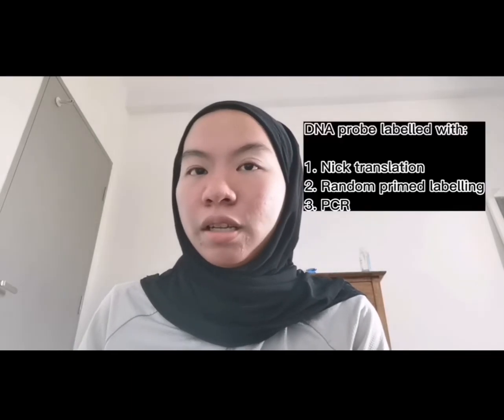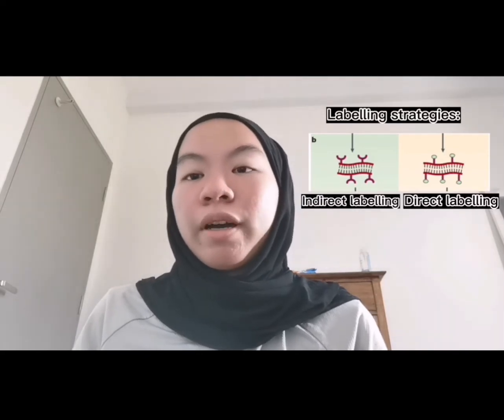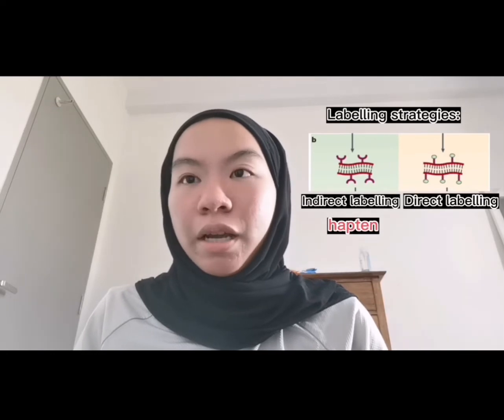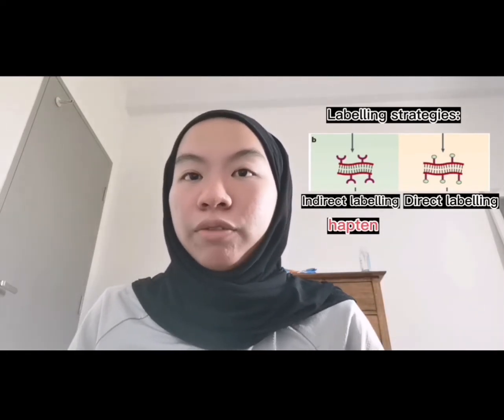The basic elements of FISH are a DNA probe and a target sequence. Before hybridization, the DNA probe will be labeled by various means such as nick translation, random prime labeling, and also PCR. Two labeling strategies are commonly used, which are indirect labeling and direct labeling. For indirect labeling, probes are labeled with modified nucleotides that contain a hapten, whereas direct labeling uses nucleotides that have been directly modified to contain a fluorophore.